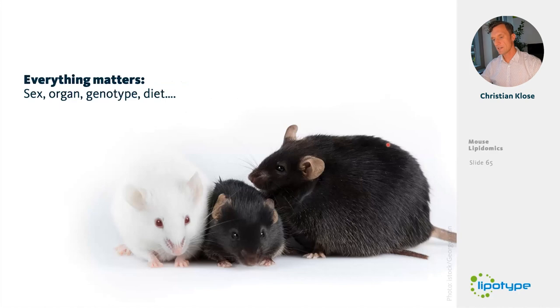So essentially, the bottom line of this talk is that with regard to lipidomics, lipid composition of the different mouse organs, everything seems to matter to some degree. So we really should expect everything to have an effect on the organ's lipidome. We saw organ, sex, genotype, and diet-specific effects. The variability of the organs also plays a role and is different between the different organs. And we also see organ-specific lipid phenotypes that are not necessarily reflected in the blood. And we see that phenotypes really depend on genetic background and the sex, and perhaps also other factors that we haven't even looked at here in this study.